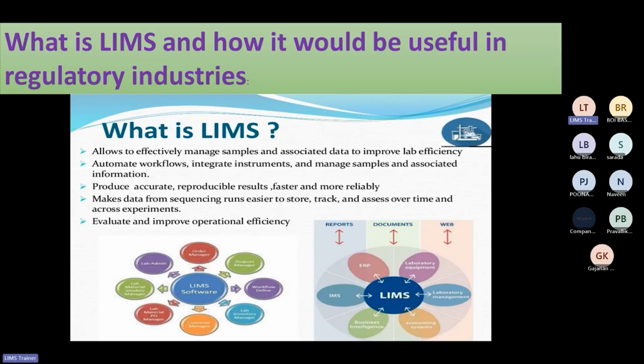Suppose you have done one analysis 10 years back, and now you want the data about that particular analysis. When the lab is working in manual mode, how will you find that data? You have to search for that particular file. You will find that particular batch number, and then you will collect that data, and it will take time.